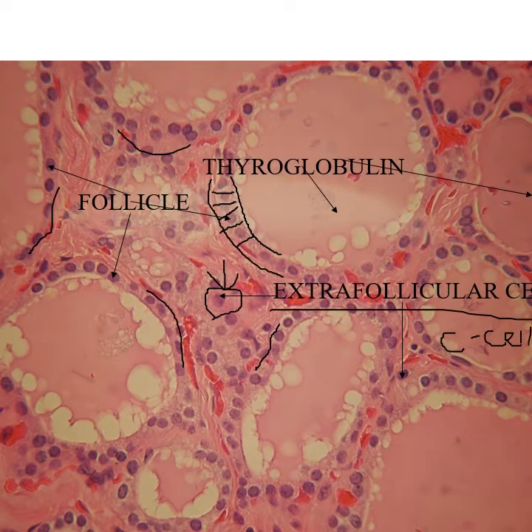This is a different population of cells. They do not secrete the thyroxine or the triiodothyronine or tetraiodothyronine. They secrete calcitonin, which, as you can probably surmise from the name, helps to lower blood calcium levels. It'll target the bone, for example, depositing excess calcium on the bone for use later.